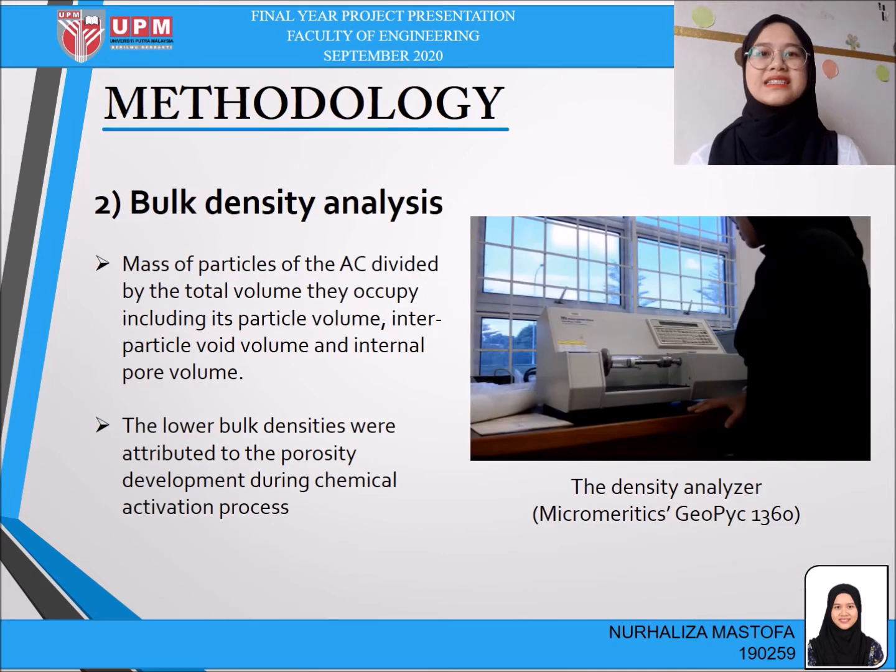The second analysis is bulk density analysis. Bulk density is the mass of particles of activated carbon divided by the total volume, including its particle volume, interparticle void volume, and internal pore volume. The lower the bulk density, the better, as it is attributed to the porosity development during the chemical activation process. Here is the video of how the bulk density analysis is done.